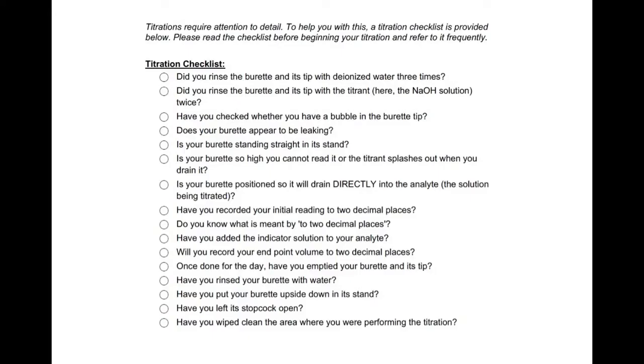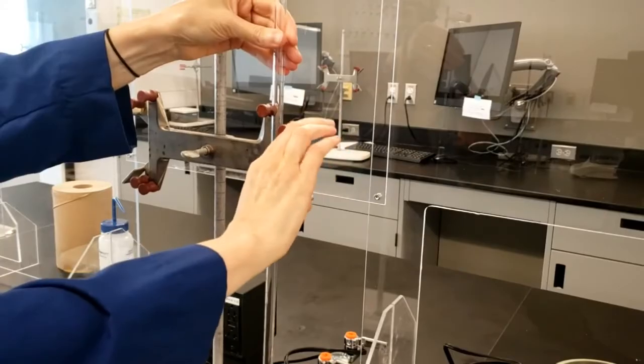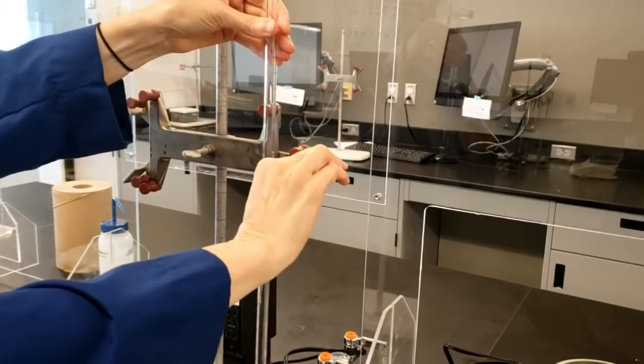Before you start, be sure to be comfortable handling the burette and the burette stand. The burette stand holds the burette in place with spring action. You must press the two levers with one hand while holding the burette with your other hand in order to remove and replace the burette from its stand.